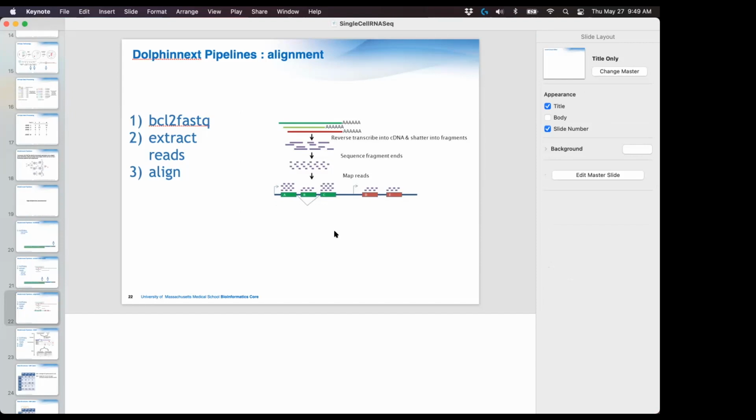The files are quite large, actually. What I will say is it scales with the number of cells in the experiment. If you have a single bulk RNA-seq library, each row is a single gene, right? Here you have many thousands of cells, so the more thousands of cells you have, the file sizes expand quite a bit.